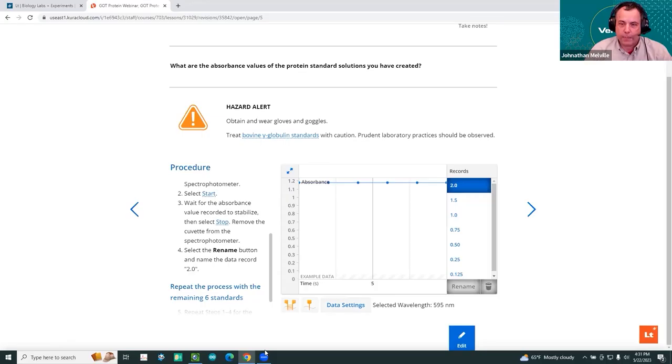Now, before I get going, does anybody have any questions about how the spectrometer works, what you can use in LT? The one thing to know is that live data collection in LT only works on PCs. You can get the sample data on other platforms, but live data collection only works in Windows or on a PC. So any questions?